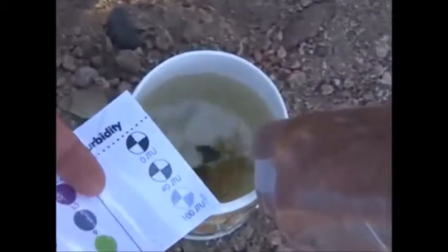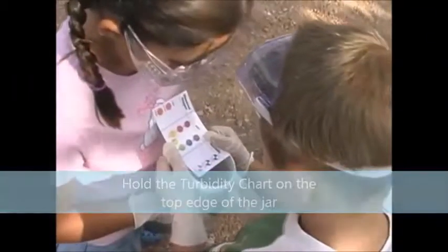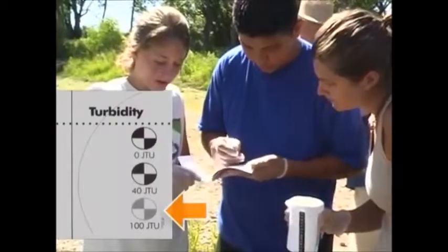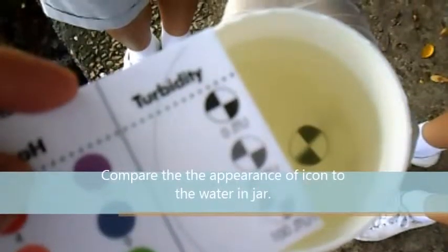Hold the turbidity scale on your card partially over the top of the jar. Now compare the turbidity measurements on the chart to the appearance of the disc inside the jar while looking through the water, and determine which one most closely matches it. Record the turbidity value: 0, 40, or 100 JTUs, or Jackson turbidity units.